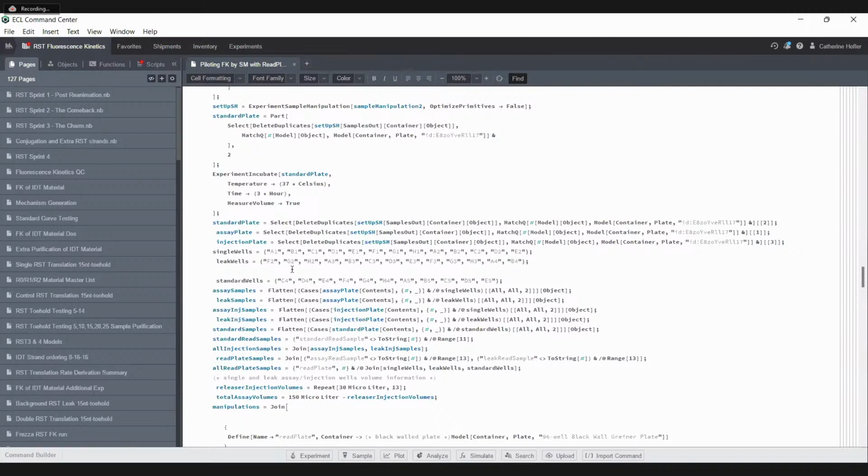So there are 3 steps: setting up the plates, incubating them, and then reading them in the plate reader. Step 1, setting up the plates, would probably take me a couple of hours. The robot can do it faster because it can pipette more things at once. I can only pipette one thing at a time. The robot can do 8 or 96. So it's probably the better part of half a day at work, right?